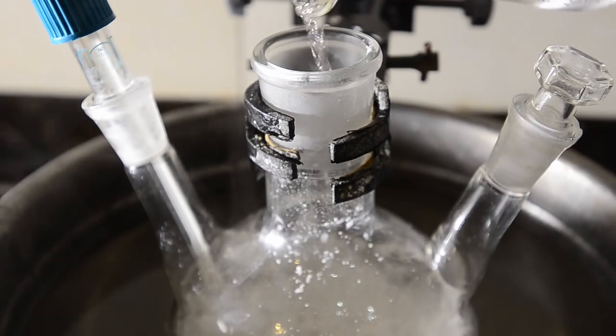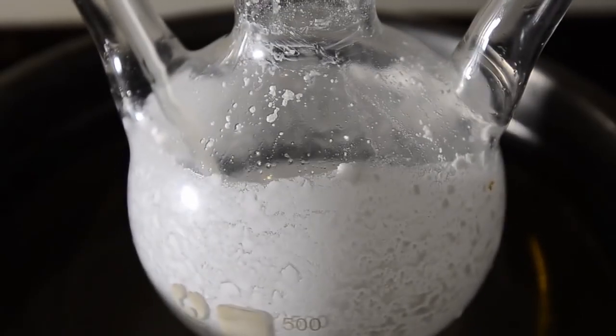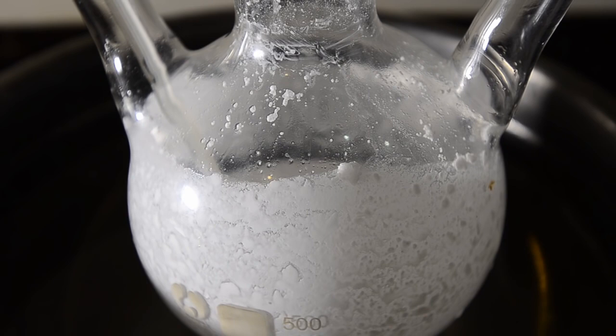Once the acetyl chloride is completely added, swirl the flask and you'll notice some more heat generated. The contents of the flask turns into a liquid slurry.